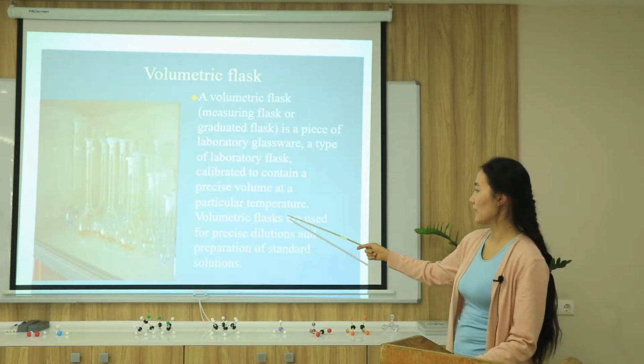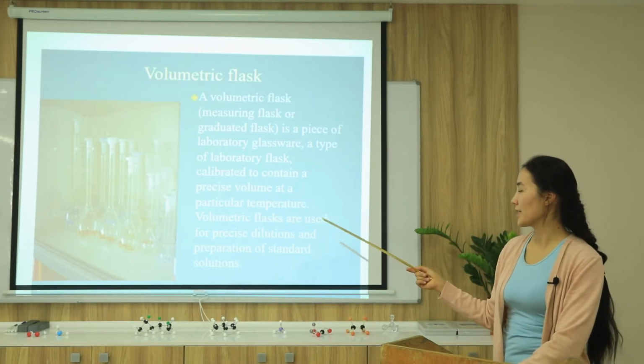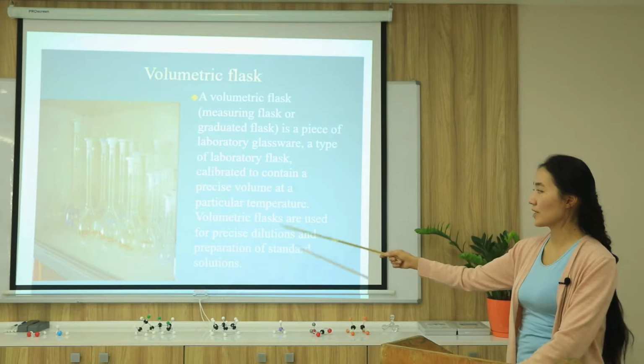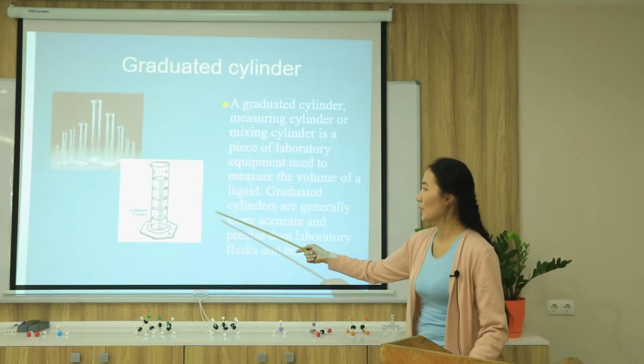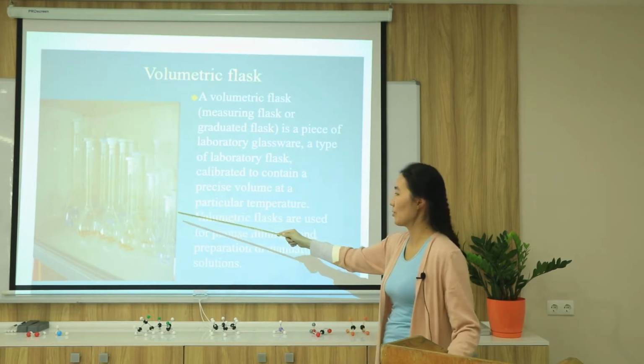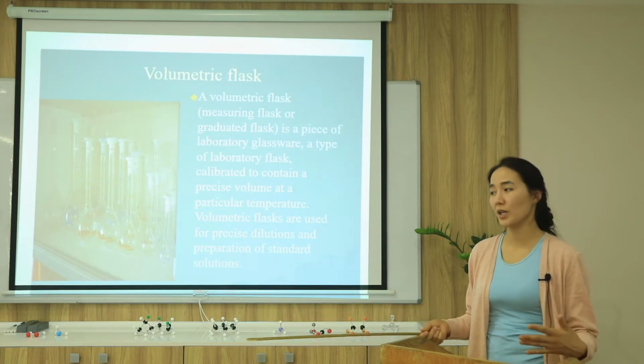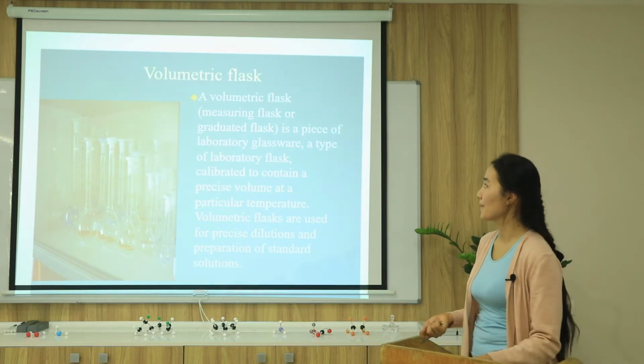Also, the volumetric flask is very useful, and it's used for precise dilutions and preparation of standard solutions, because here we have some amount of solution in the bottom, and they are closed. When we are preparing the standard solution, we can keep it for the next lectures.